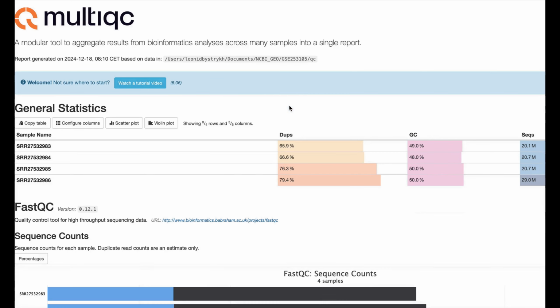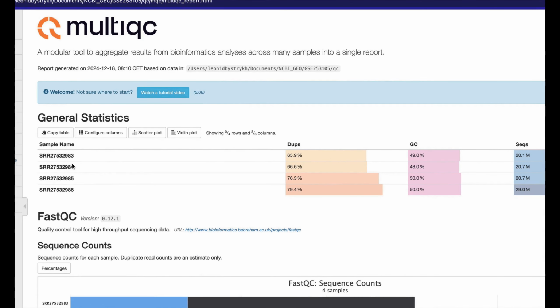What you see inside is a pretty simple business. It will literally put next to one another all the data picked from separate fastqc data and tell you the statistics of duplicates, GC. This data is a bit strange. GC is different by 1 or 2%.